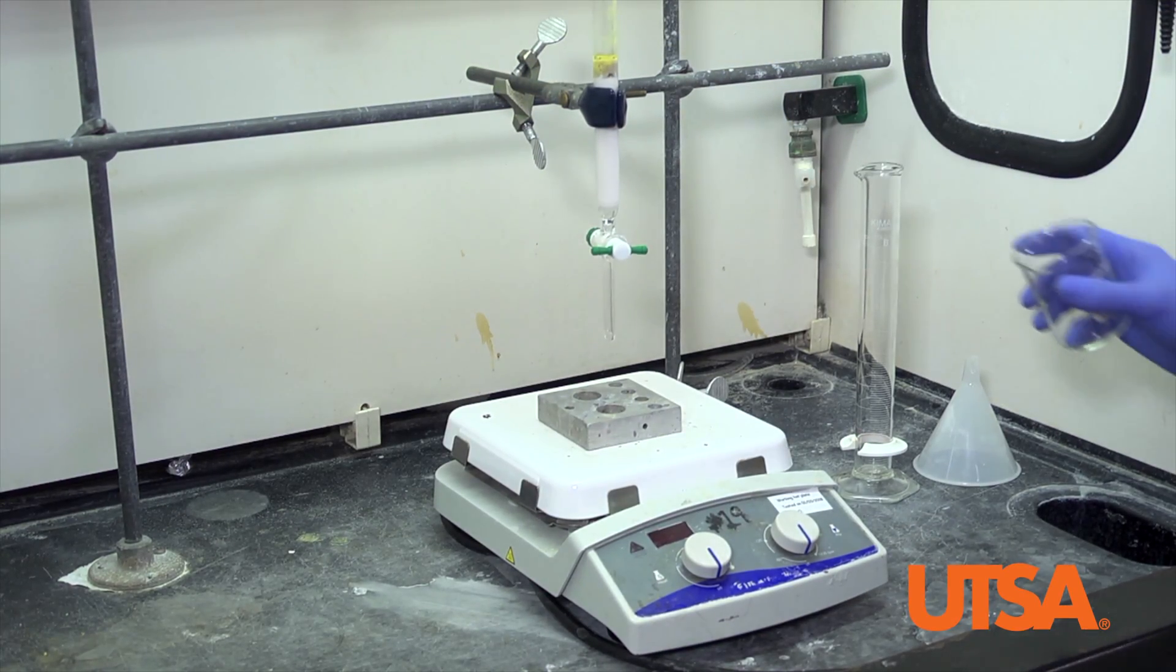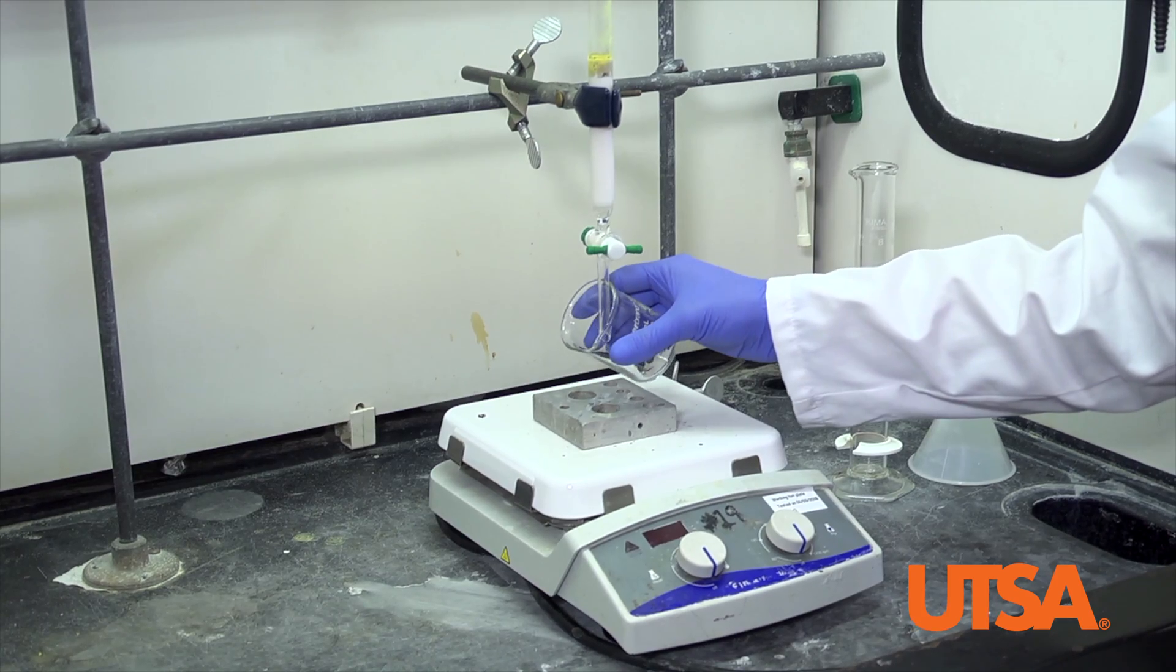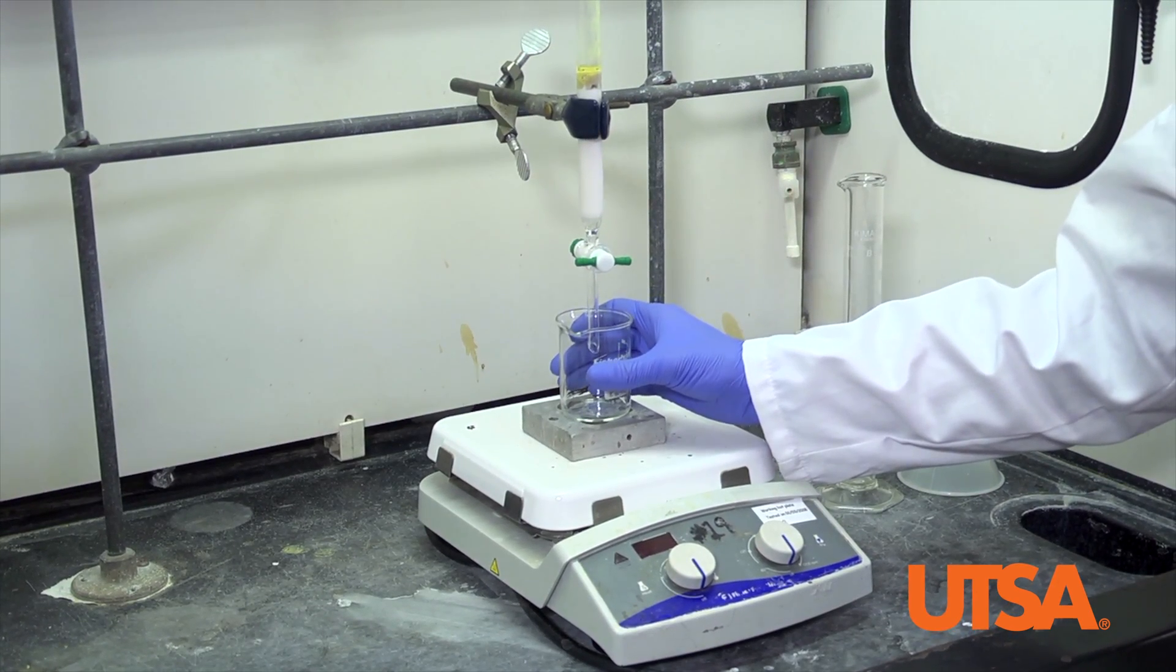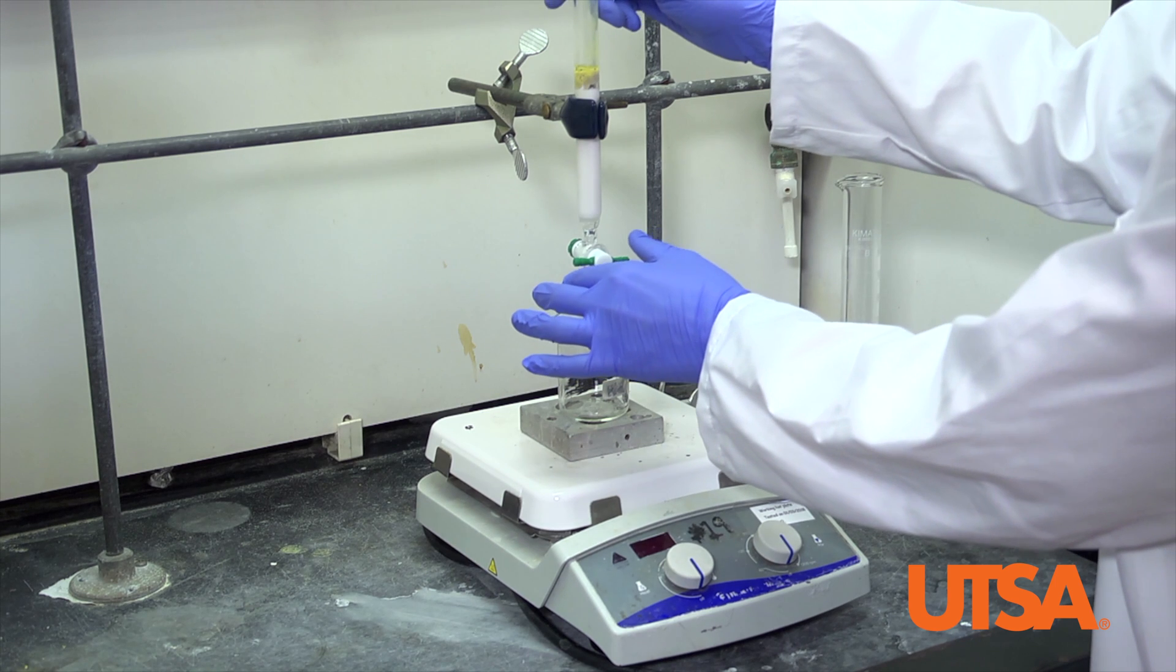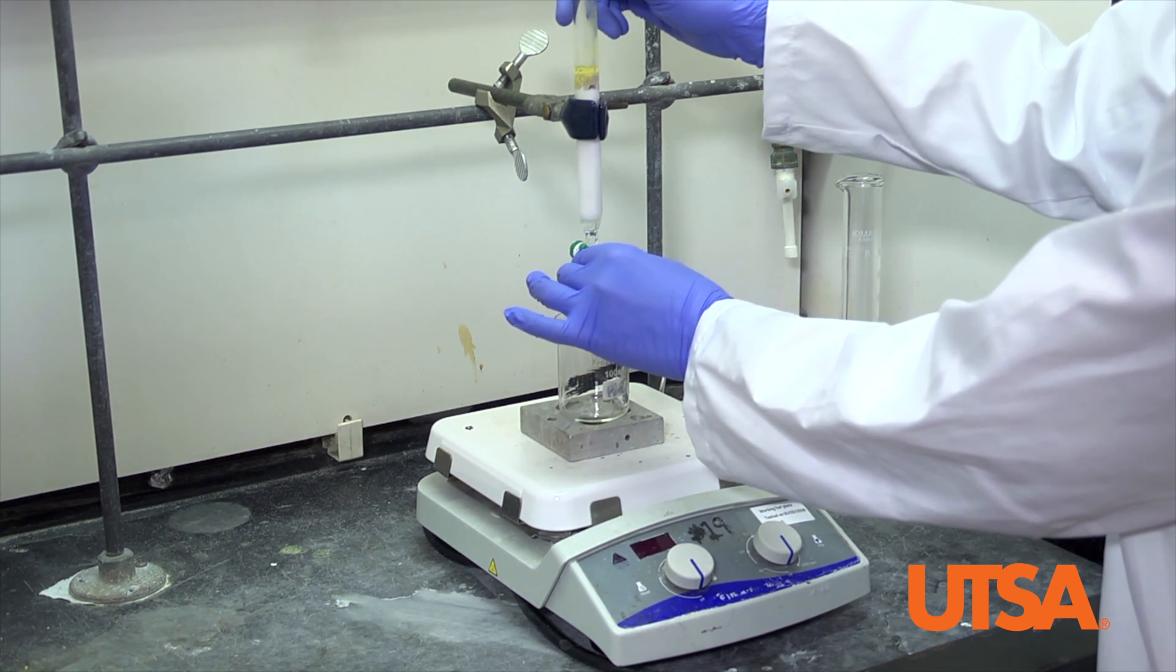Add a new Erlenmeyer flask beneath the column and open the stopcock to drain your sample to the top of the alumina.